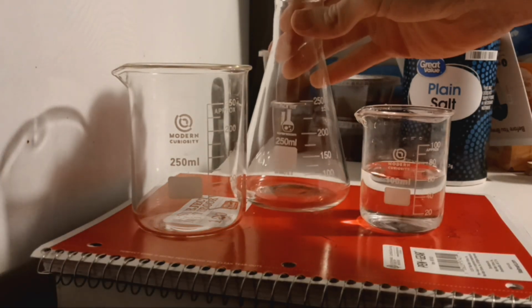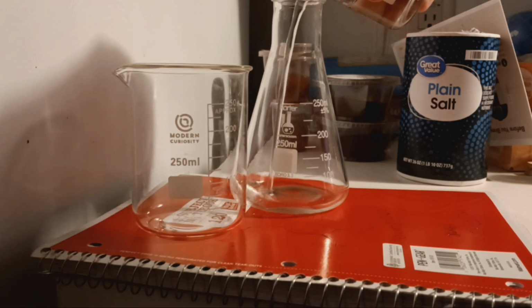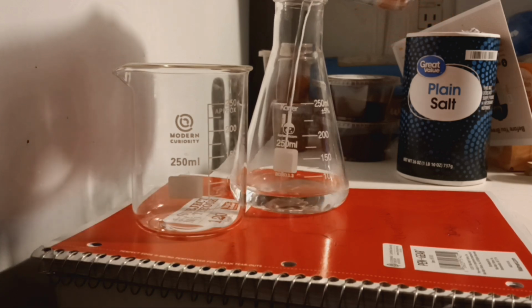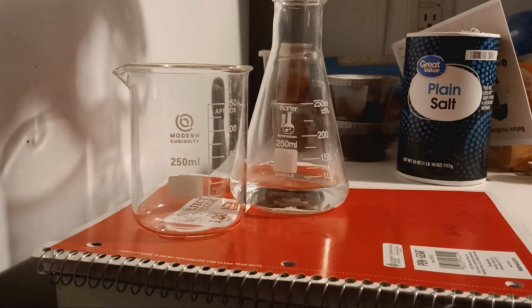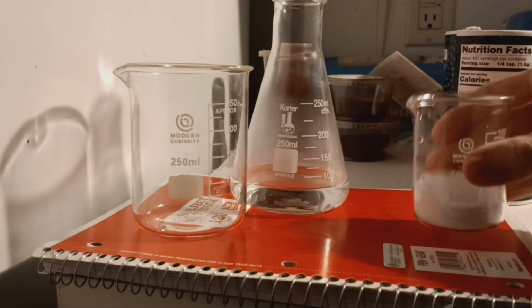Hello everybody, today we'll be redoing a previous experiment. The last time I did this, I used a carabiner, which people said was coated with zinc. Now, I do not believe this is a big problem, as the amount of zinc would be just so insignificant. You'll see that in today's video.